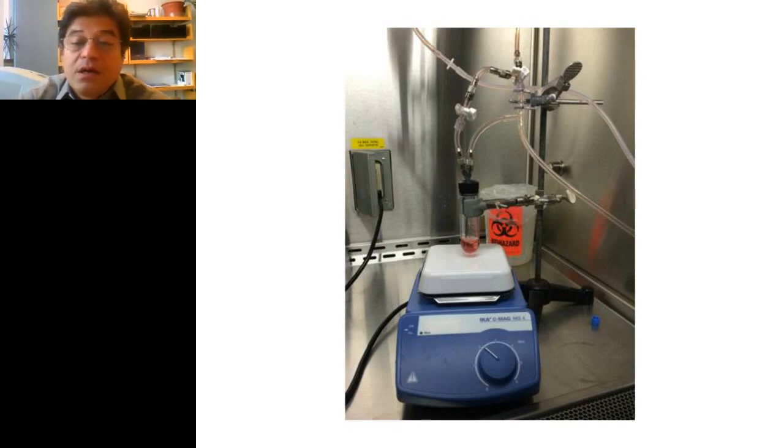They end up in this little chamber here, and the goal there is to eliminate any air in the system, just like a flow cytometer. Centrifugal elutriators really need to be free of air. Air is a bad thing in an elutriator. So this helps to do that, in that the cells will drip into that volume, and from there they're slowly introduced into the system from the pressure head coming from the peristaltic pump.